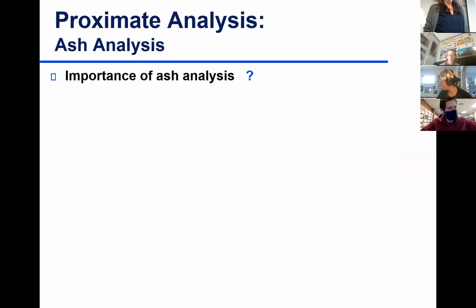So what's the importance of ash analysis? Why does it matter? Why do we need to analyze ash? Mineral analysis. Yes, that's very much true. Mineral analysis is important. Sometimes we have to determine our mineral content, and in order to determine our mineral content, we have to ash our sample first. Good. Whether it's dry ashing or wet ashing.